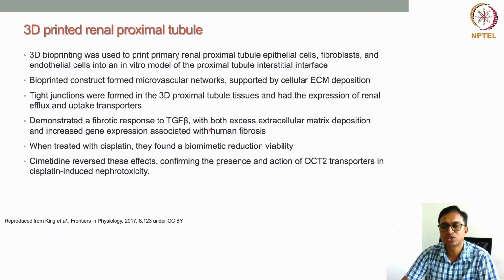So they are trying to see the physiological function of the 3D printed proximal tubule structures. When they injected this TGF beta, the cells present in the tubule expressed high matrix. They synthesized more matrix, and that was deposited in the structure. Because of that, fibrosis was generated.